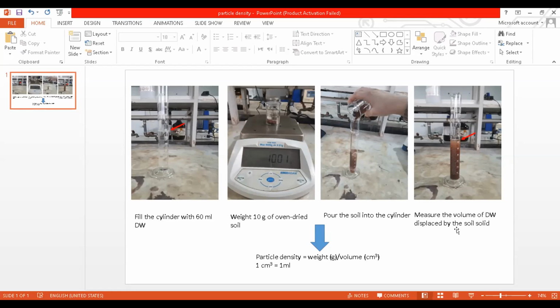So at least this methodology we use here in the laboratory gives some idea. Of course the accuracy is not high, but at least it will give you some measurement related to the particle density when it is needed. And it is very fast and easy in general. Yes, no need for chemicals to be used.